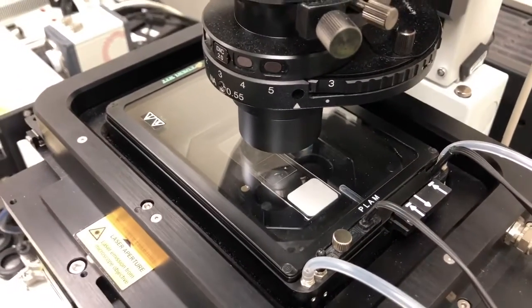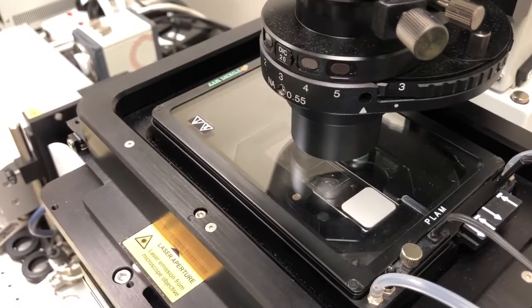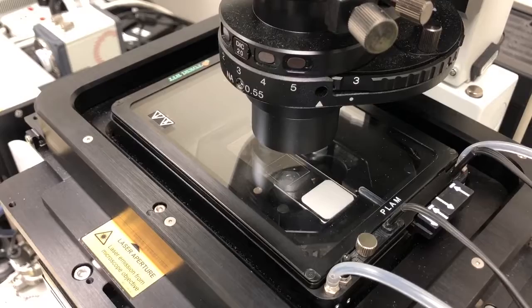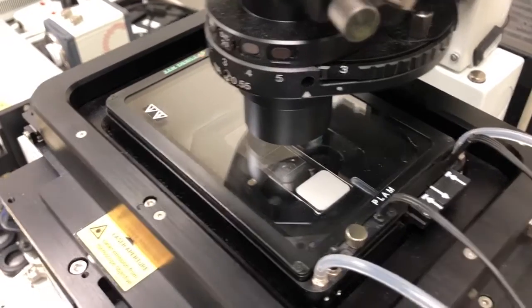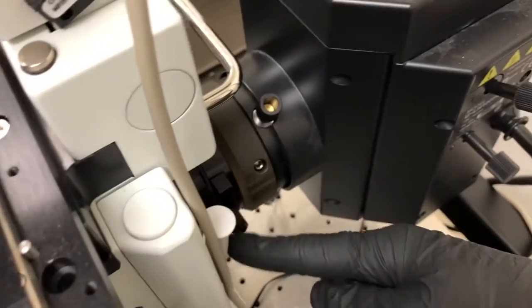So when we're looking by eye, what we need to do is pull that out and then put it in a position where we can see the sample comfortably by eye. And once we're done, we should push that back in. So again, it's this slider here to avoid bleaching our sample.